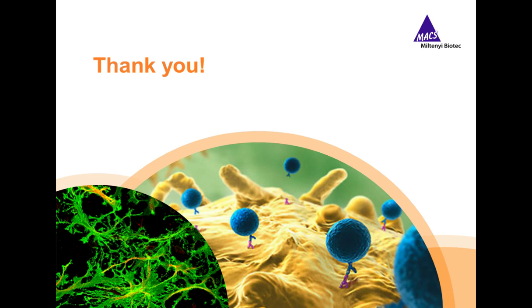Thank you. It looks like we have time for one more question. How many neural stem cells can you acquire from the subventricular zone from one adult mouse, and what is the viability? As I showed to you, we can isolate around 50,000 neural stem cells from the SVZ of 5 mice, so that means 10,000 neural stem cells from the SVZ of 1 mouse. That also works, so we showed that you can use the SVZ of only 1 mouse brain and then do the Tyto sorting. And the viability is again more than 90%.